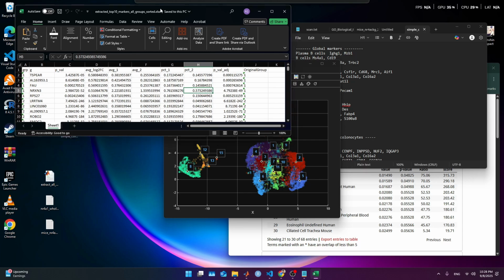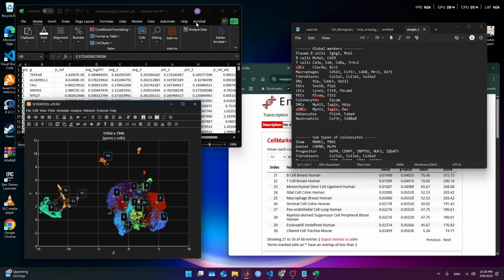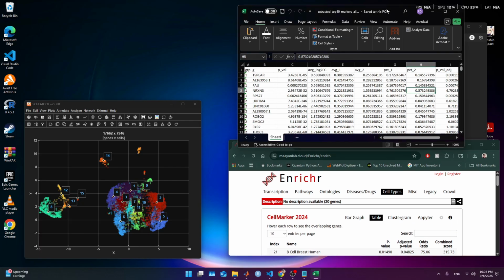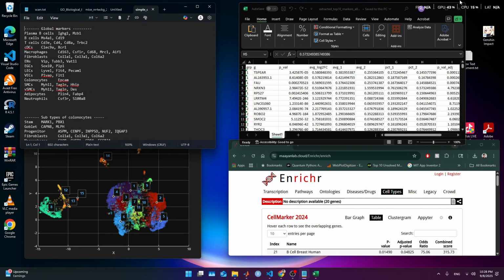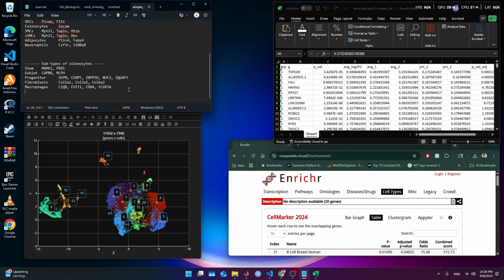So what we're gonna do here, it's again do this this way, minimize this a little bit here and there, get this body here. All right, we get this. Remember, we are populating here in the bottom, and I'm gonna discuss something in the end about that.